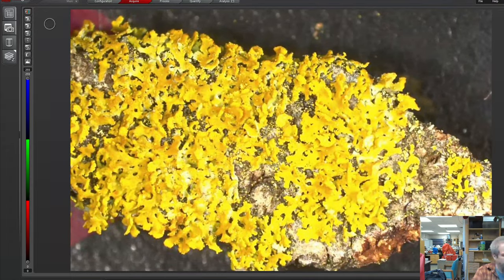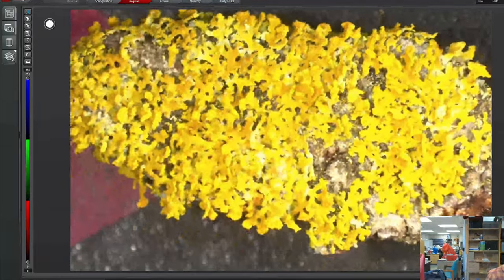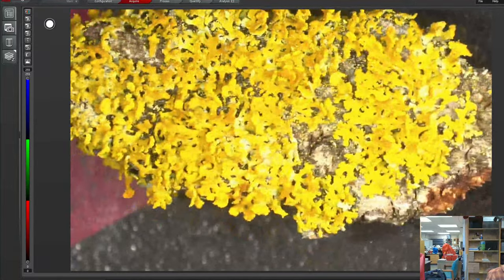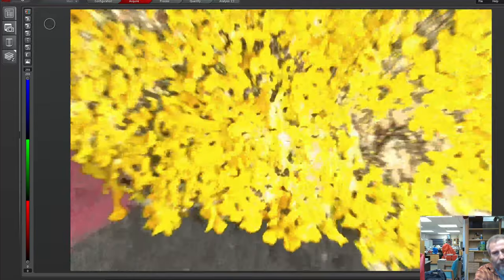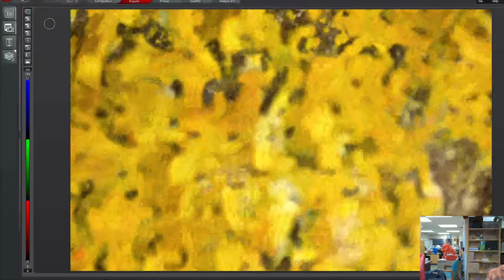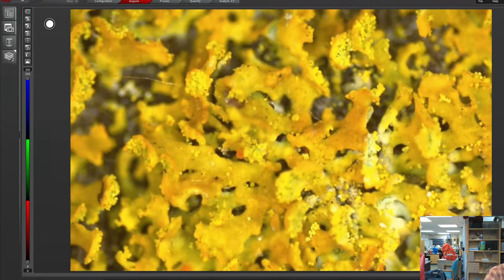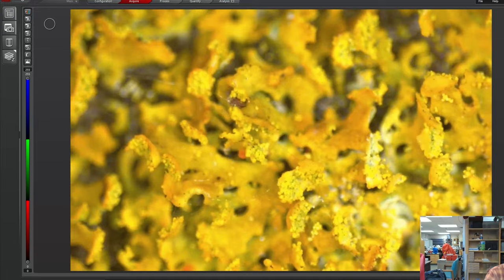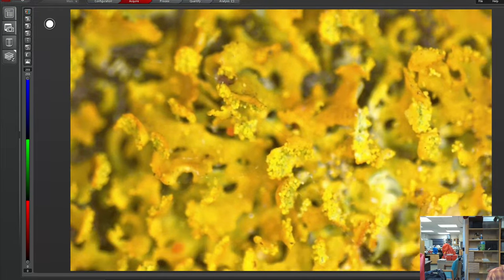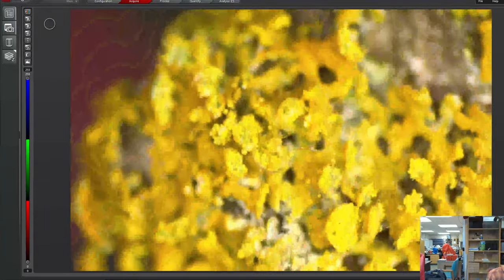And we sometimes look at the lichen, and this exact lichen, actually, in the SEM. I mean, not the specimen, but from the same tree, and it's the same material. So a lot of times people don't realize their sidewalks are covered with lichen. It's basically everywhere, on rocks and on trees, all over the place. This one's a really pretty one. It's got this sort of bright yellow and red color.